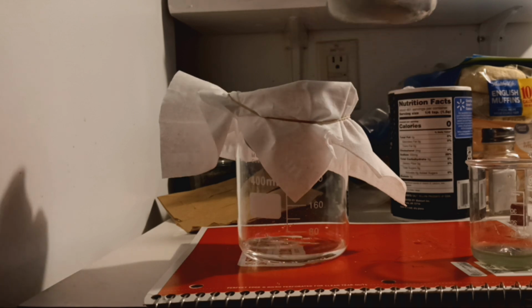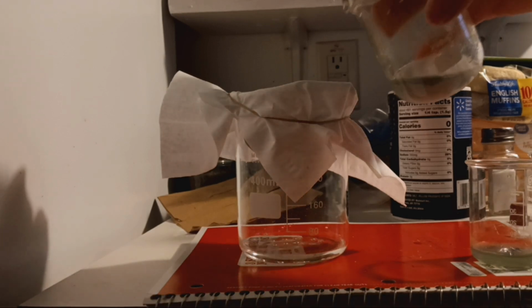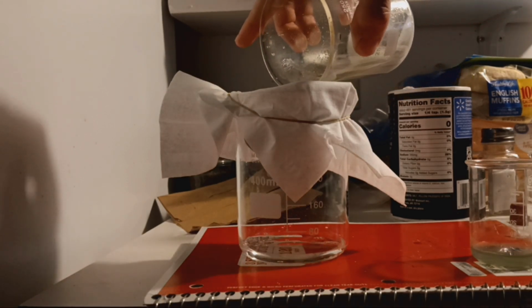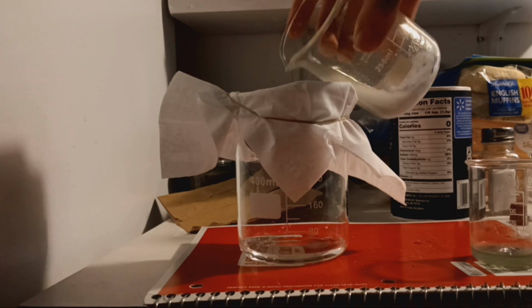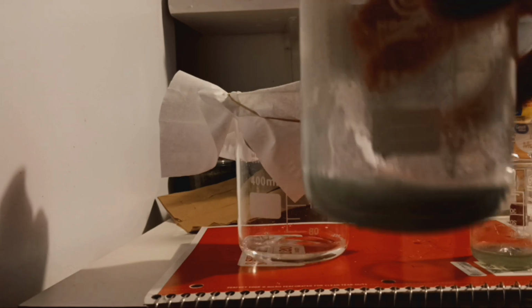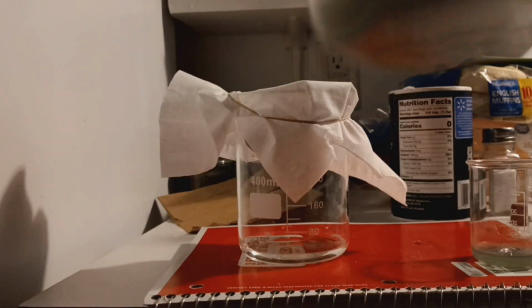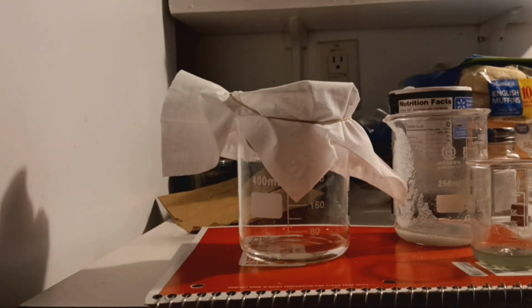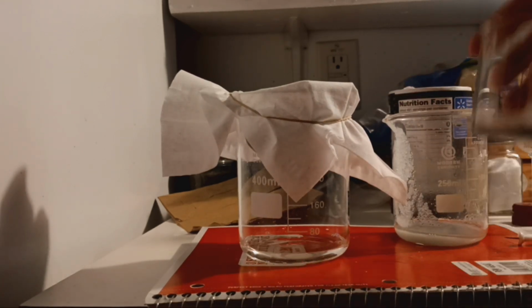Now just enjoy watching this beautiful filtration. A very super important thing to note about this filtration is that we have another solid in the liquid. This unidentified solid is undissolved salt, which never got electrolyzed, or maybe it did get electrolyzed and it became the very notorious, very spooky sodium hydroxide. This could also be zinc oxides. I doubt it, however. This is more than likely just salt.